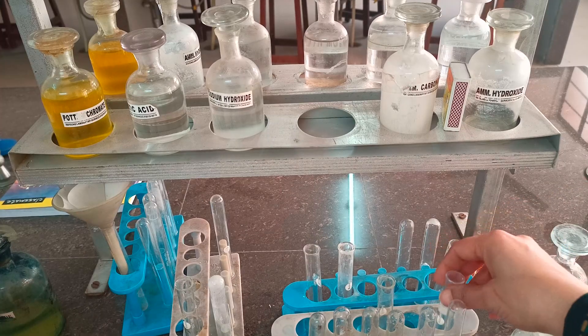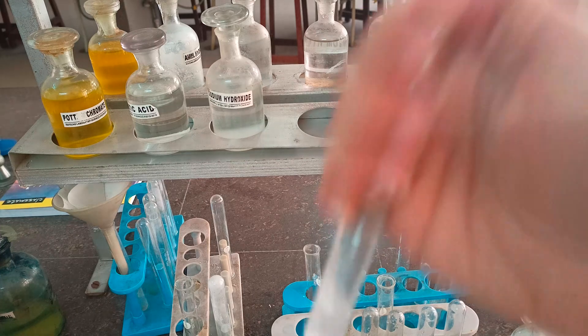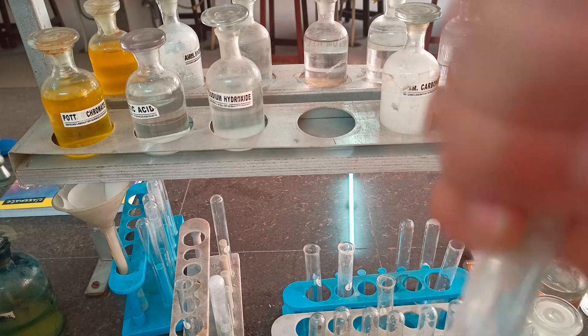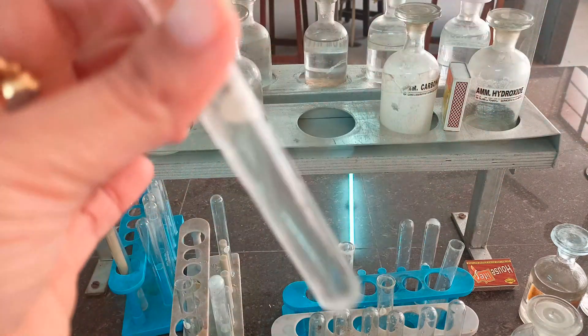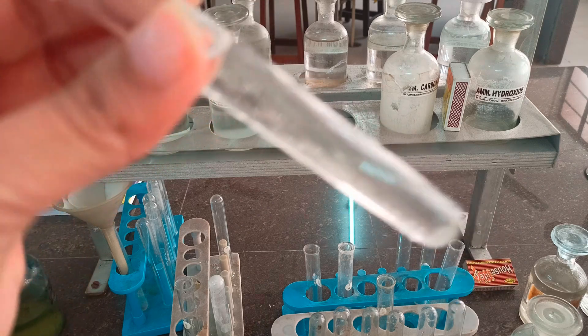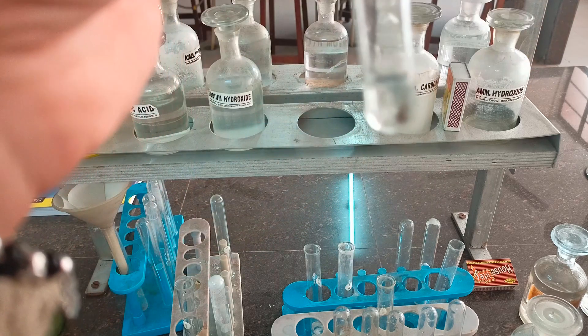Sorry for the camera movement. We have taken the salt and dissolved it in water to form a clear solution. I have prepared a larger aqueous solution because we need it for the basic radical tests as well. From this one part, I am going to take a portion.